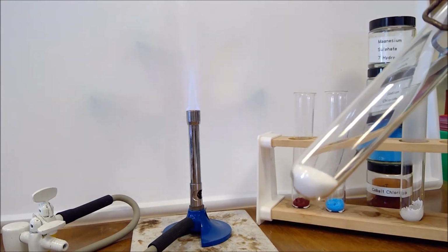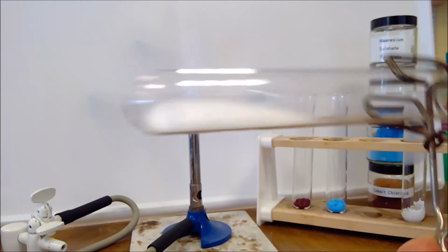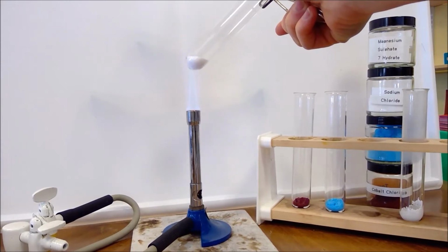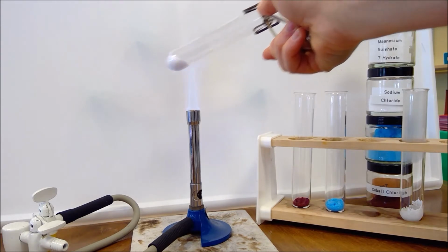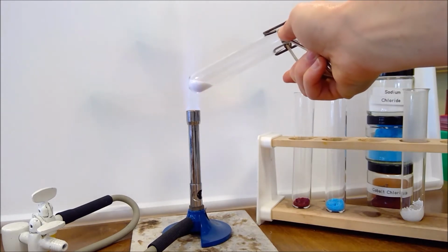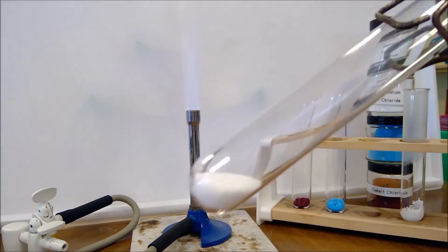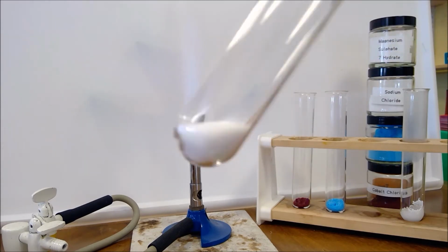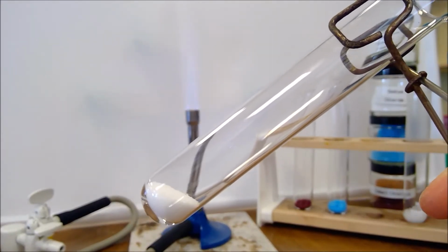So our next solid is sodium chloride. So just a close look at our sodium chloride there. Okay, so the solid is very much the same as before, and we can't see any condensation in the tube there.